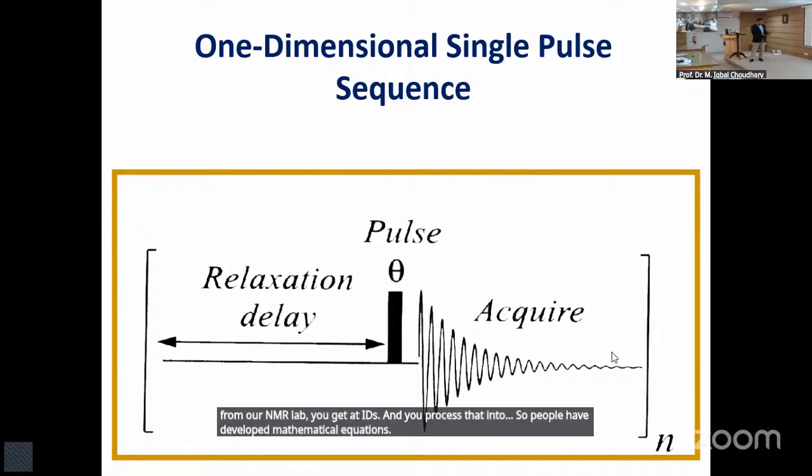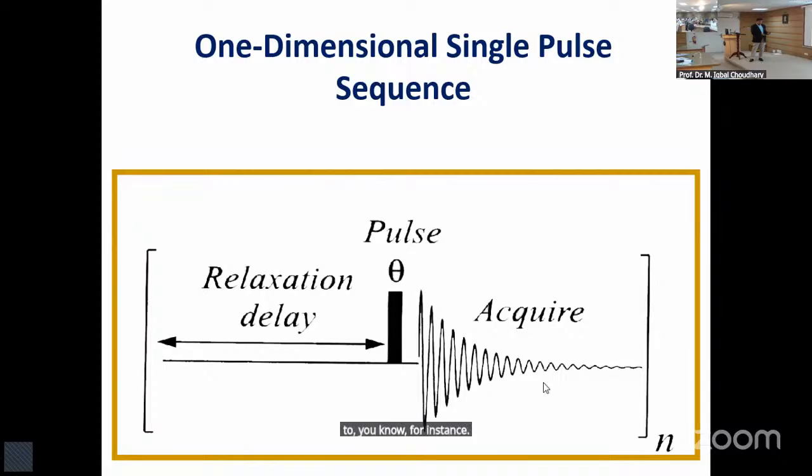For instance, if they are interested in resolution, we multiply that with some factor, so the contribution of the tail is increased. If you divide with some factor, the contribution decreases. This is all numbers, right? So you can play with that.